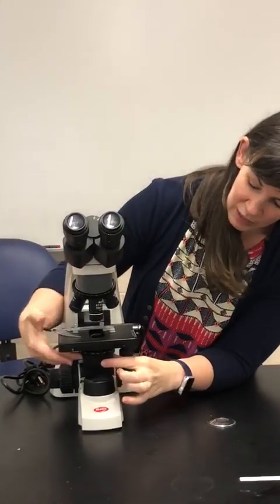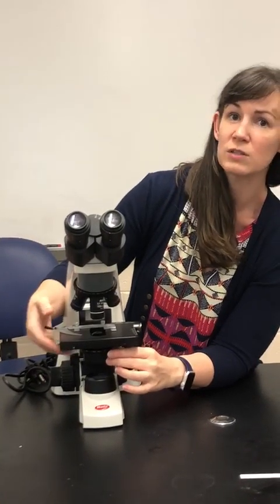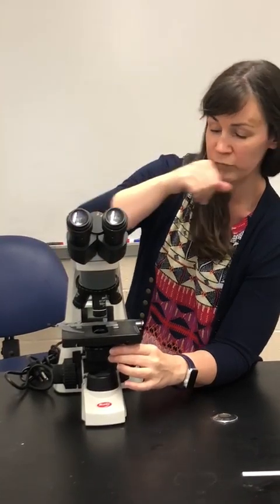Directly below the stage, we have what is called the condenser. The condenser helps focus the light into your specimen, and you always want to have your condenser all the way open for what we are doing here.